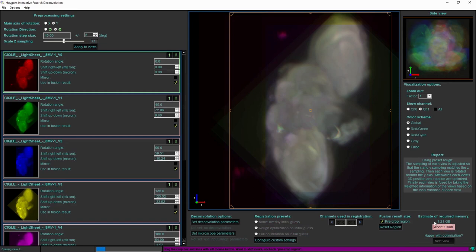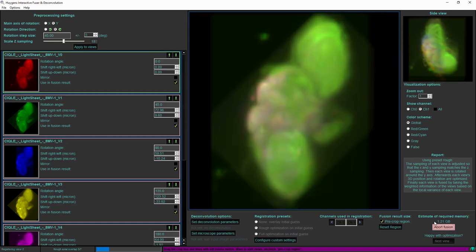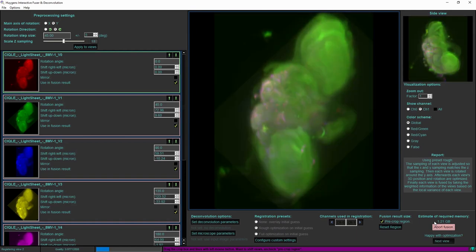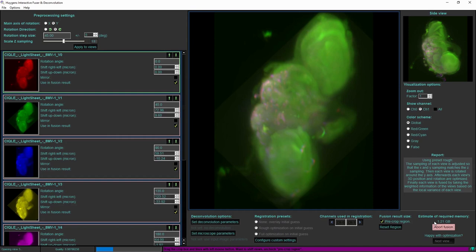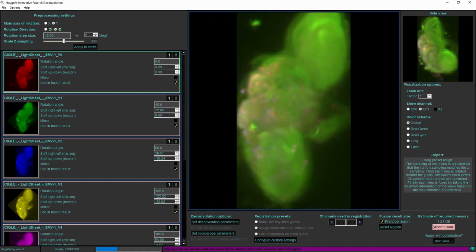Huygens will now go through the views one by one or two at a time actually, and it will incrementally add each new view to the result that has been already fused until this moment. It will first for each view attempt a few different shifts along the main axis of rotation as that is what we see happening here. That is the only shift that is not yet specified in my initial guess.